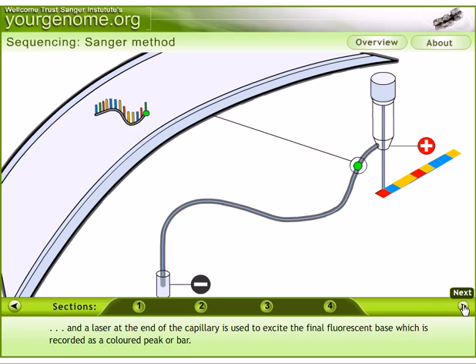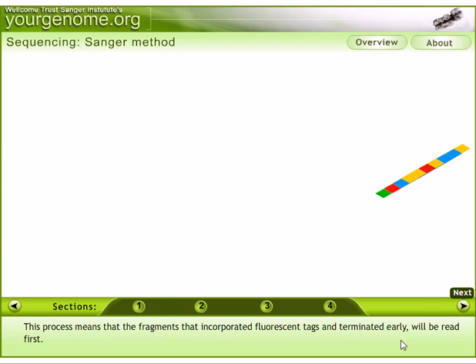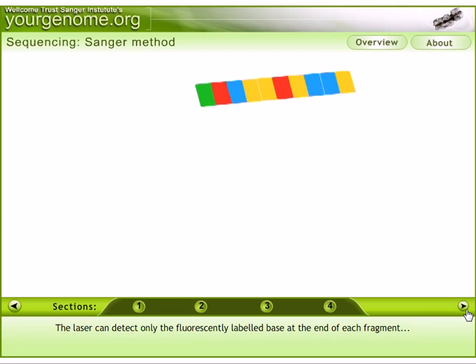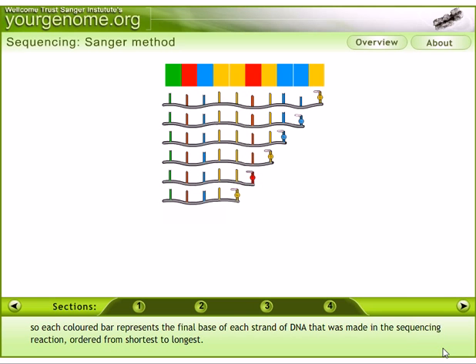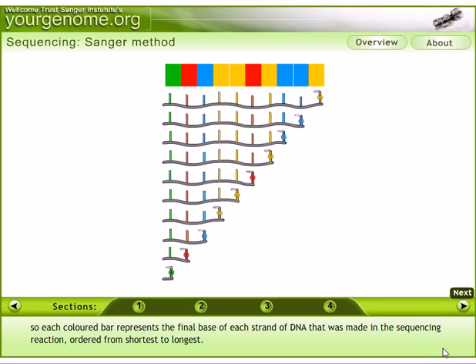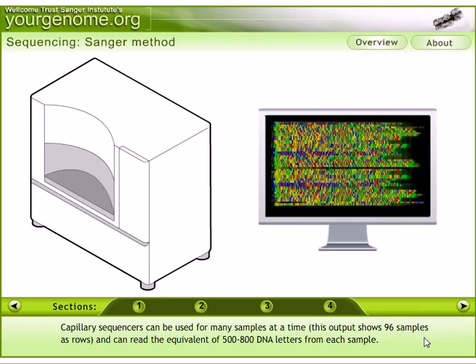Each time a fragment passes through the laser, its fluorescence is detected and recorded as a colored peak or bar. Fragments that incorporated fluorescent tags and terminated early will be read first. The laser can detect only the fluorescently labeled bases at the end of each fragment — this is a key concept for understanding Sanger sequencing. Each colored bar represents the final base of each DNA strand made in the sequencing reaction, ordered from shortest to longest.